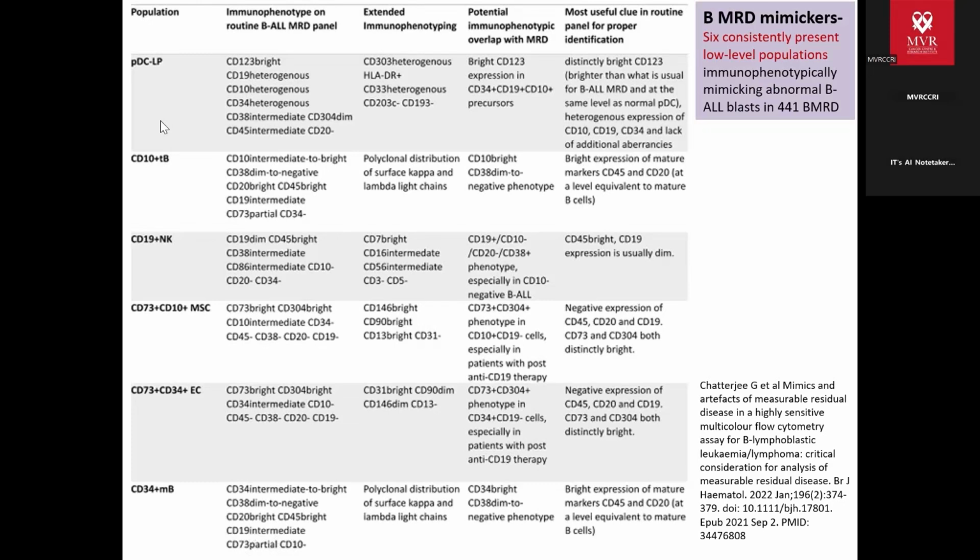In view of the dilute nature, the percentage of MRD may not be representative. Or since LOQ of this particular sample is 0.003, but there is very low TC, the number of events could not be acquired up to what we are expecting. So the sensitivity of the assay may be low. Quantification may be affected by bone marrow aplasia, may be repeated if the count has recovered, if you're still suspecting an MRD positivity. So please do read the comments.